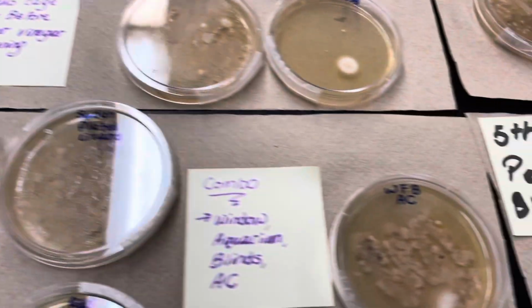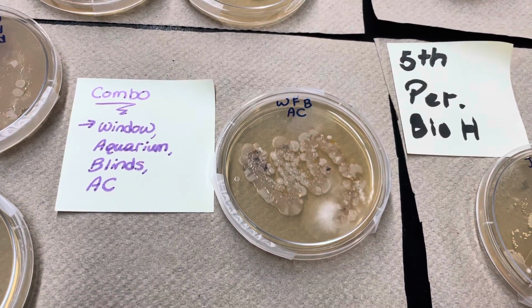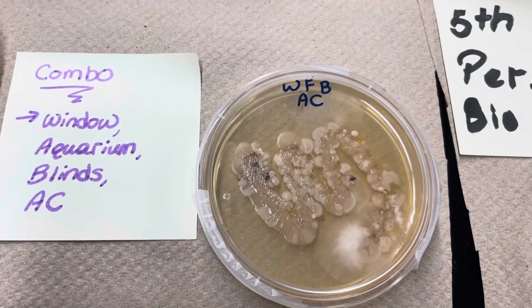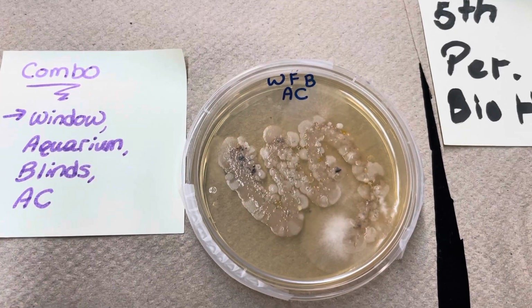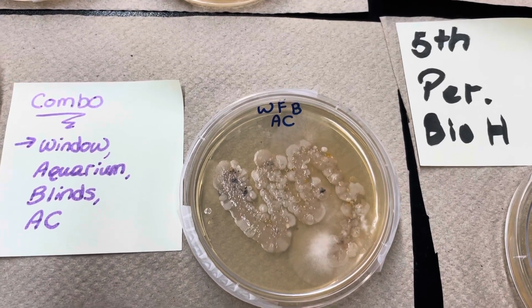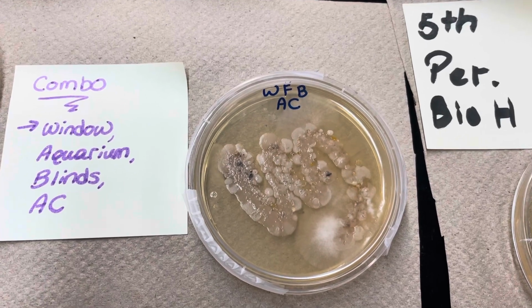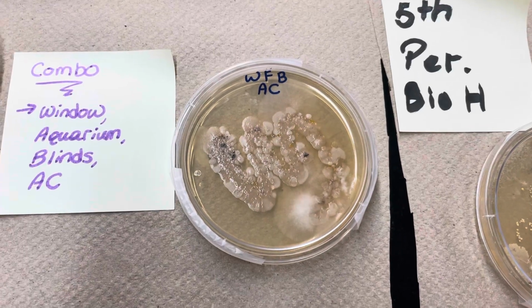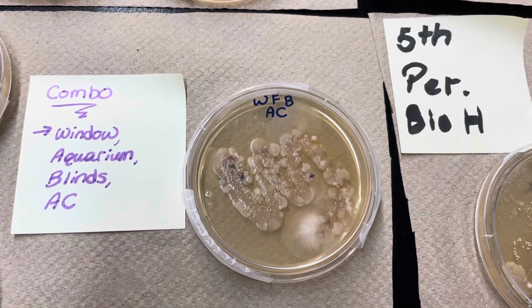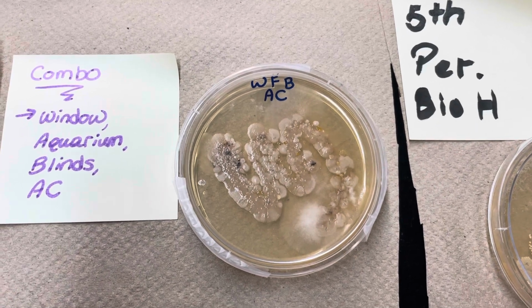And then the nastiest thing I had was this weird combination when I was swabbing my aquarium, my blinds, the inside of the AC. And again, that's one of those that's probably 10 or 15 species or more, and it's a combination of bacteria, fungus, mold, what you name it, it's there. But it's the air we breathe. It's stuff that's all around us. It just looks nastier than it really is the moment you give it this medium, this agar, to grow. It's kind of like I said in class, if you're in space, you cannot see an individual person, but you can see a city. And that's kind of the same thing. You can't see individual bacterial cells, but when you make a colony, especially with agar, then you can see it with the naked eye.